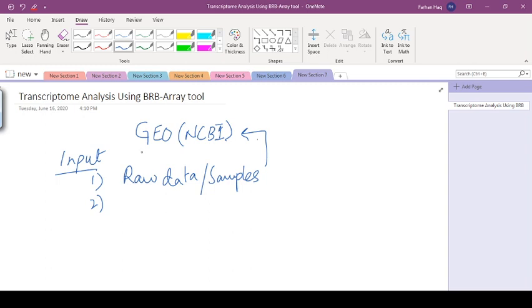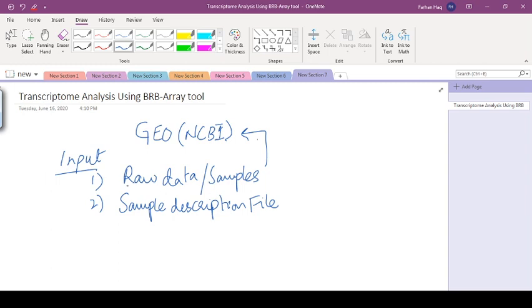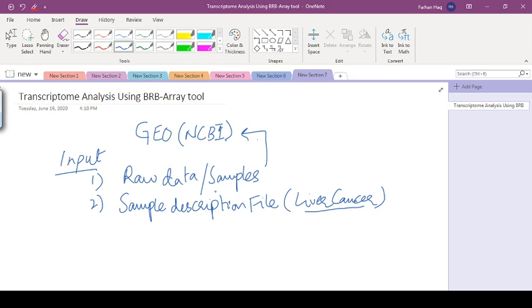After downloading the raw data, we also need the sample description file. Actually, this is known as descriptor file in BRB-array. Sample description means all the description associated with the raw samples which we have downloaded. For example, if we are using any cancer like liver cancer, we have downloaded the dataset raw data of liver cancer. Then this sample description file means that for each sample and patient, all the information related to it, for instance, what is the age of the patient, what is the grade of the patient, what is the survival rate of the patient. All the information related to that is called sample description file, which is also available along with the dataset on GEO.